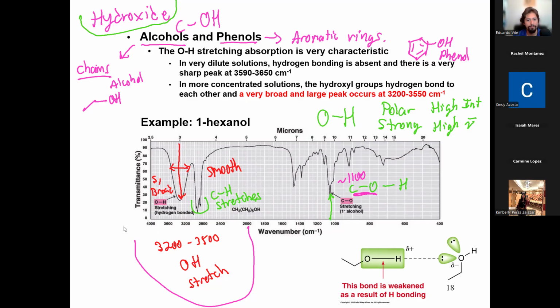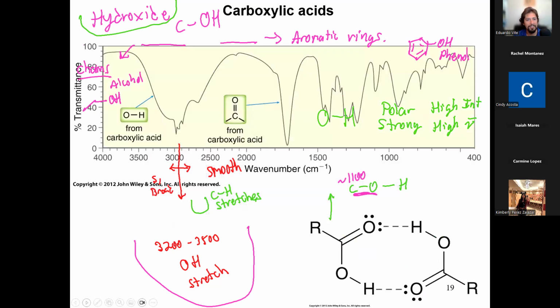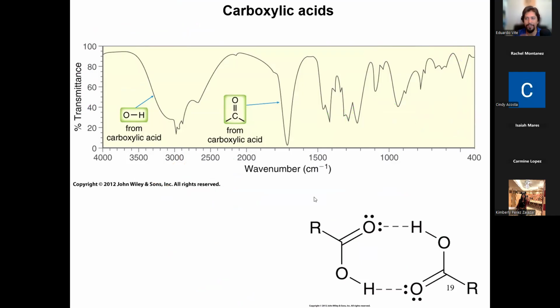All right. Okay, so next example then. This is where, once again, the language becomes important because now we go back to the carbonyl. If you have a carbonyl plus an alcohol or a hydroxide, right? So a carbonyl plus hydroxide, this gives you carboxylic acid.